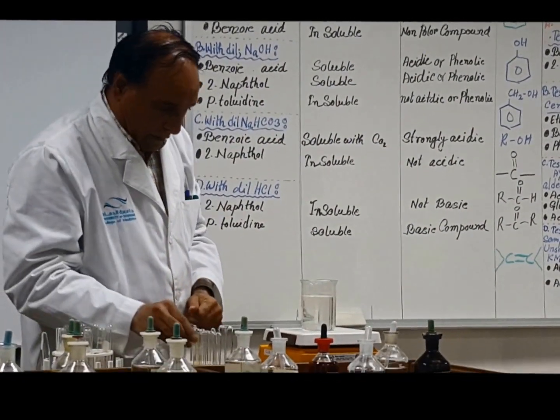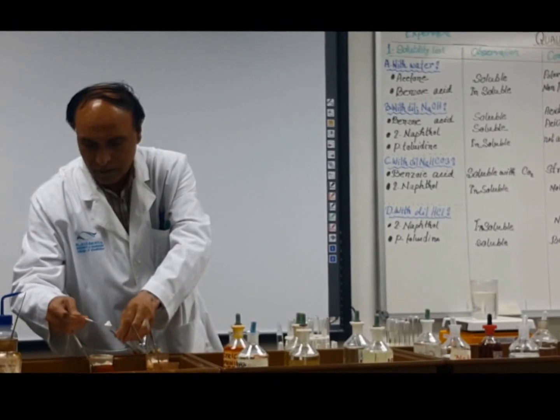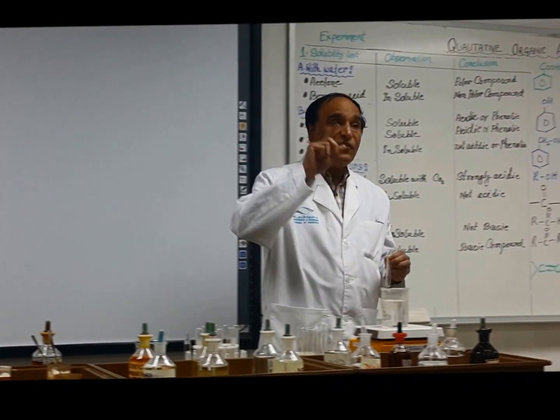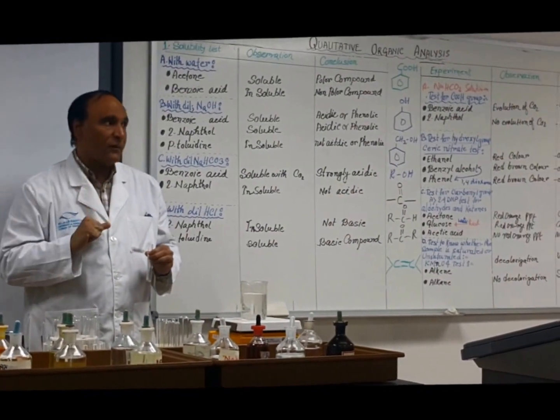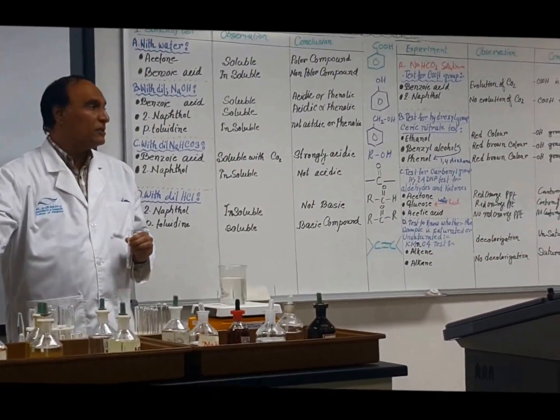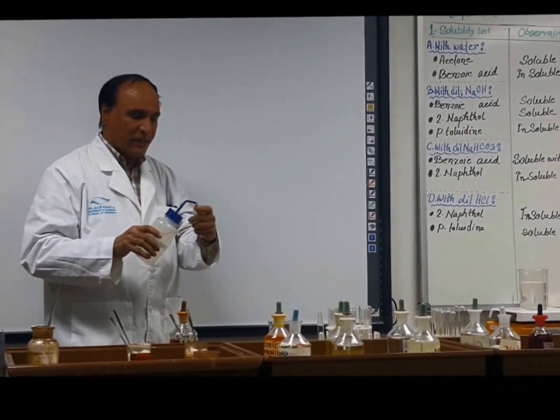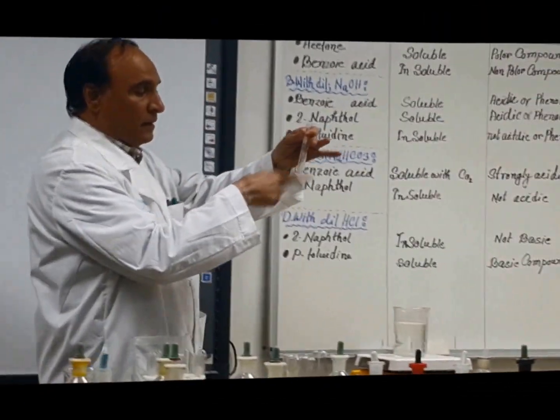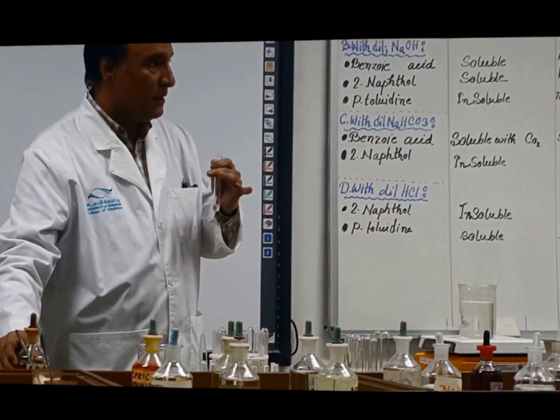Now, if I take glucose, you know glucose? What is the formula? C6H12O6. With the first carbon of the glucose, there is an aldehyde. So we can do this test. This is solid, and glucose is soluble in water. If I add into it 2,4-dinitrophenylhydrazine, I should get a test.